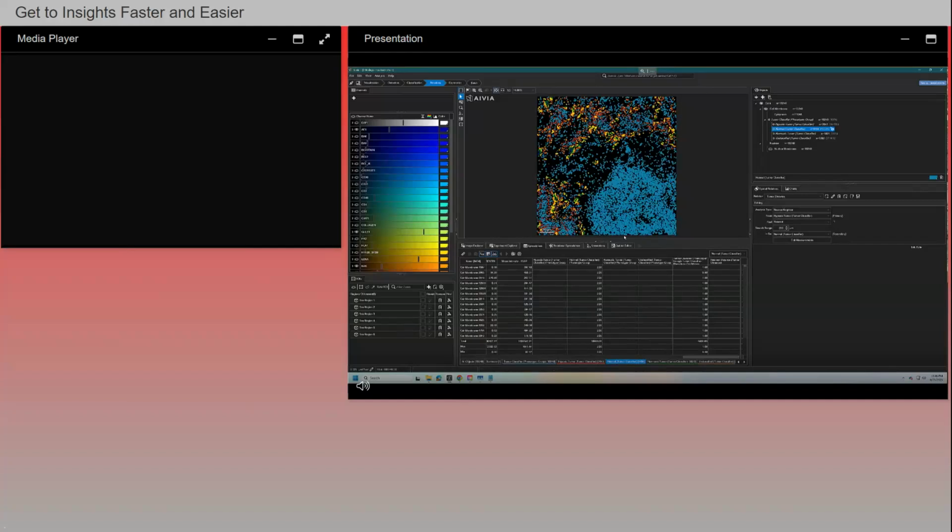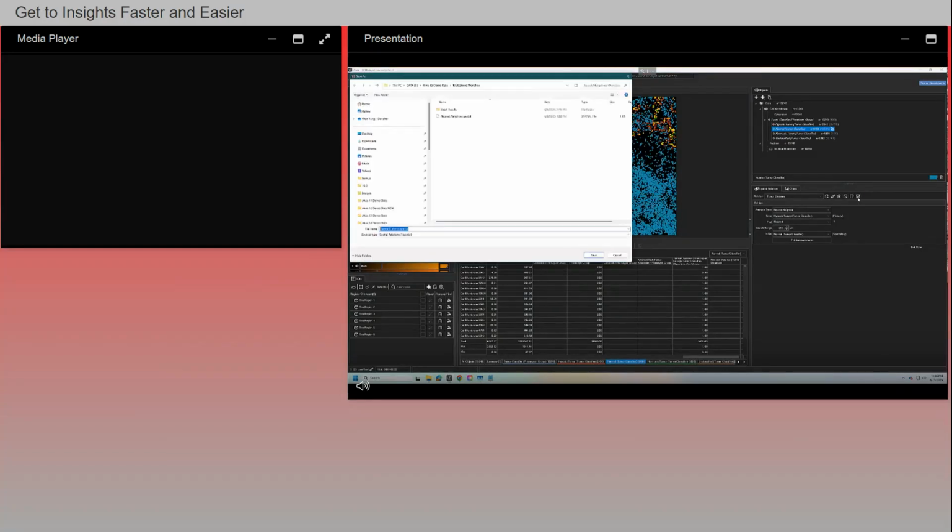So this is how you do distance analysis in 2D and 3D between any phenotypes, any object sets, any object types. You can batch this as well. In fact, let me show you how to do that. So I'm going to save the spatial rule.